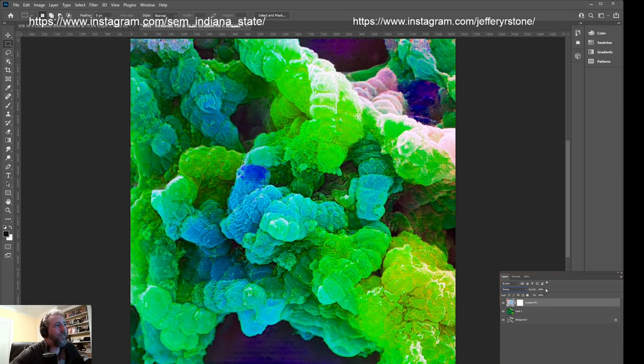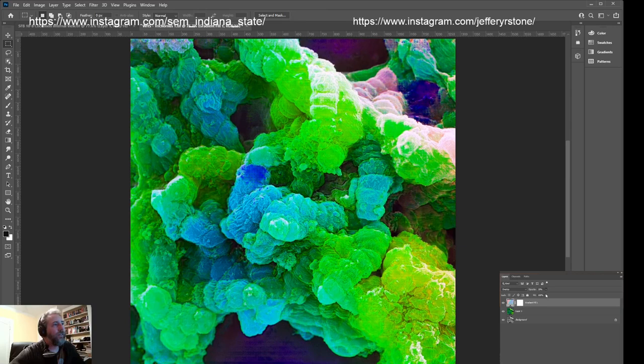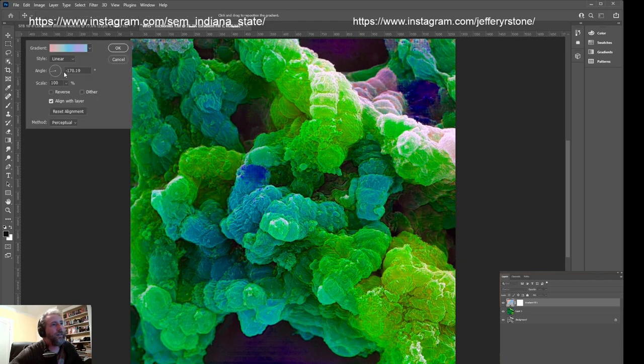And then you can also change the opacity. So this is how much of it's sort of showing through. And if you want it to all be there, you can set it that way, or you can just put it at a percentage. And is that showing? I always need to peek. So let's say I decide I don't really like this one. You can just go back in and change it, and change the angle. You can change all the settings so you don't have to feel like you're stuck with whatever you did.